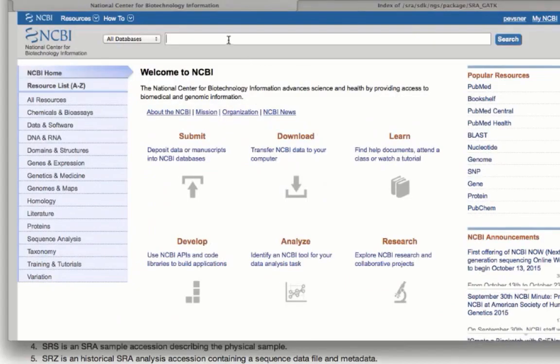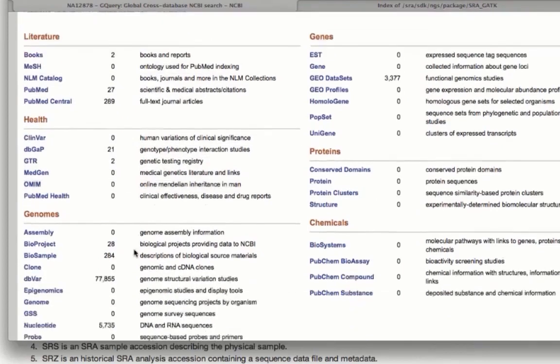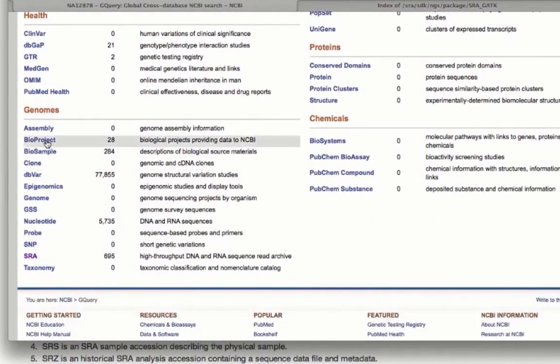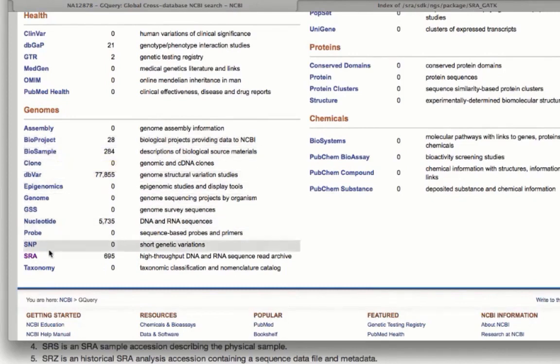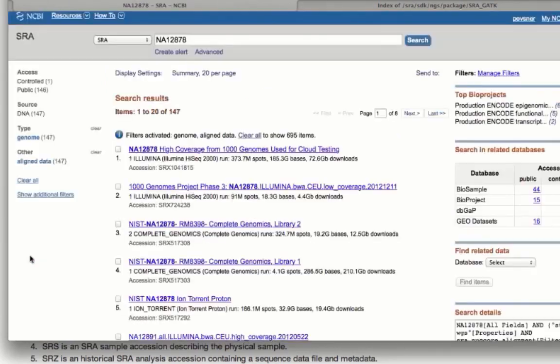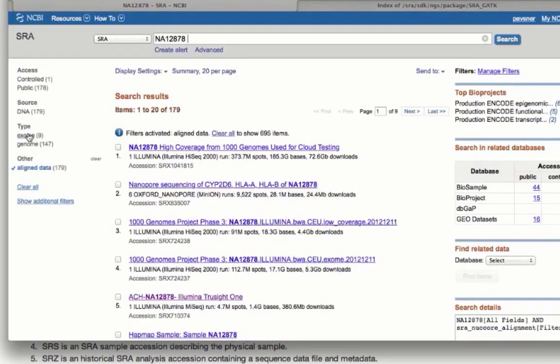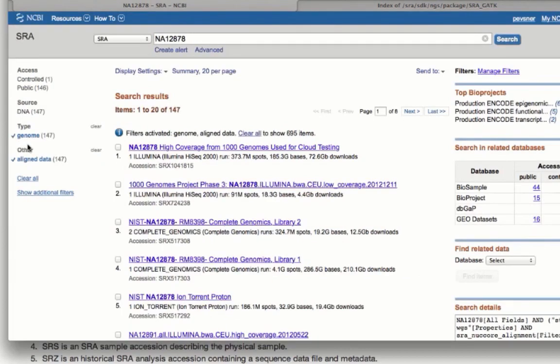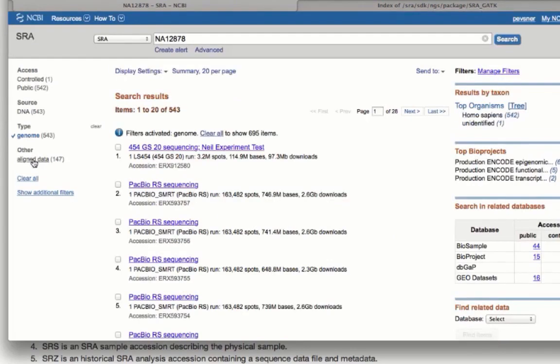And so here we are. We do the search in the 40 or so ENTRE databases. There are many different entries that are available. We'll focus on the ones here under genomes. The bio project is very useful to look at to get an overview. Bio samples also are very useful. Database of Variation has many entries. Nucleotide. We're going to go to SRA, where there are 695 entries. On the left sidebar, we can specify that we want to look at the genome or the exome. In our case, the genome is fine. And for the purpose of our workflow, we have to have aligned data. And so many of the data sets are not aligned. And we're going to restrict our search there, again, just by clicking on the left sidebar.